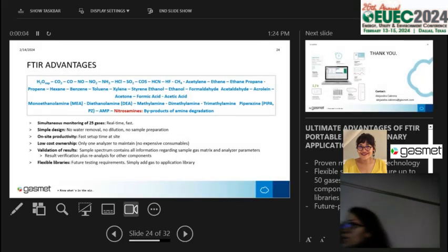So yeah, we had some there. Typically we can see sub parts per million. Range-wise, we offer like 0 to 5 to 50 parts per million. Low detection typically would occur around 0.5 parts per million to 1 part per million, which sometimes can be tough after the membrane. Yes, it can be just a couple parts per billion sometimes, but nitrosamines are one of those that are tricky sometimes, not super low in terms of a single part per billion, but we can get to like 100 parts per billion sometimes, yes.